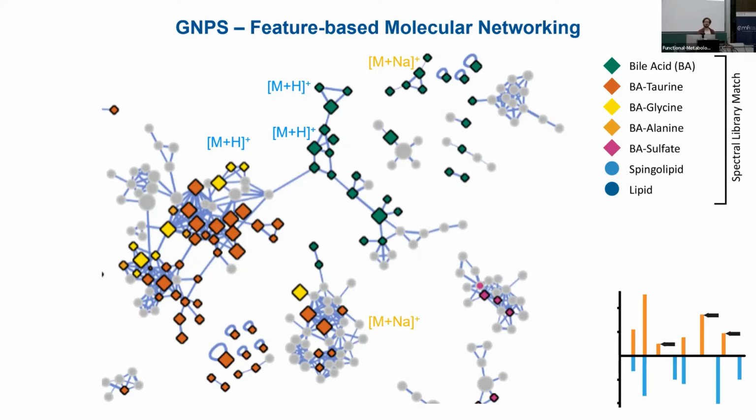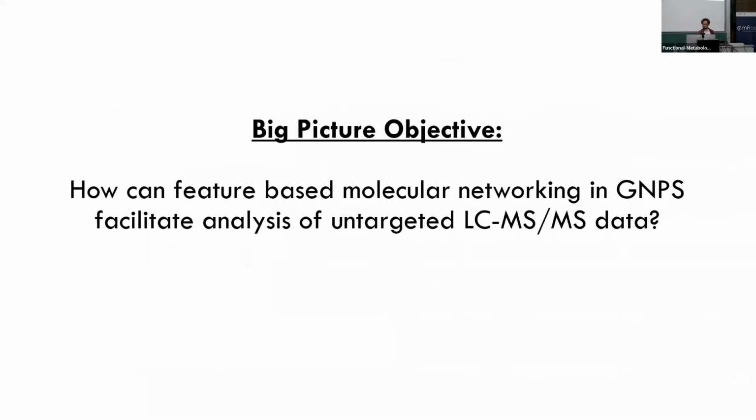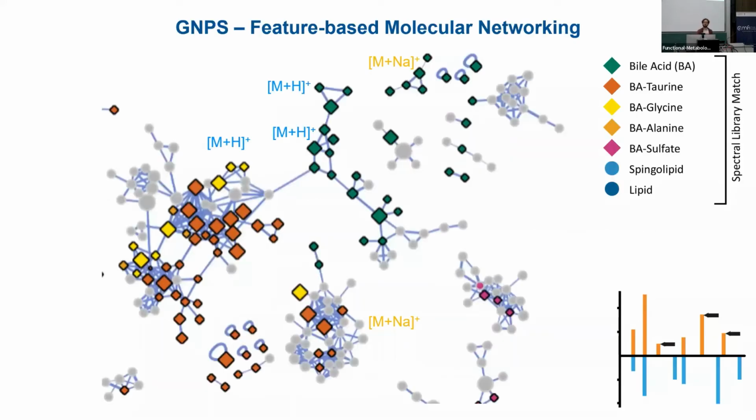And most of the things we're going to do work with this. So it is very important to understand the concept of this network. And Danny's also going to show you how to make the most out of your network. There's not going to be one visualization that satisfies you in all needs. You always have to find the best way to convey the message that's in the networks, and it sometimes gets very complex.